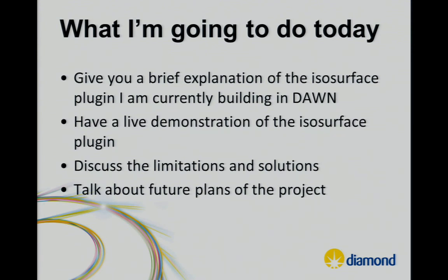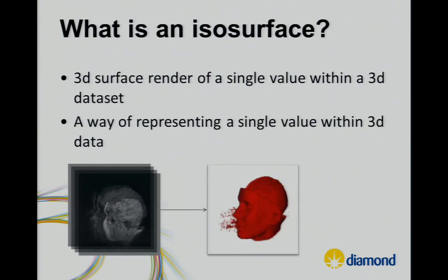Today, I'm going to give a brief explanation of the Isosurface plugin. I'm not going to go into much detail because I don't have much time and I could talk for hours about it. I'm mainly going to give you a live demonstration and then I'm going to talk about the limitations and the solutions of what Dawn provides and then hopefully talk about the future plans of the project.